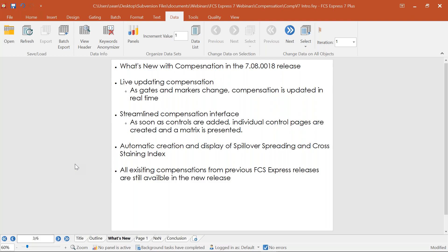Starting with what's new in this latest release: the biggest thing you'll notice is that everything is pretty much automated and live updating in the software. As you move gates and markers and change which controls are used, the compensation updates in real time. So if you move a gate on one of your controls, everything in the matrix downstream — including the new spillover spreading matrix and cross-staining index matrices — all of that is updating.